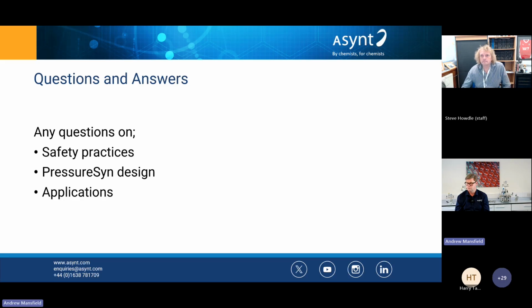Of sodium hydroxide or potassium hydroxide. I think when we're talking about chemical compatibility, this is where we start getting into the particulars about the ratings for different temperatures and pressures, because essentially that will take into consideration these calculations of the risks of different grades of materials. So obviously stainless steel and glass wouldn't be appropriate with high concentrations of hydroxides, but PTFE is perfectly compatible, and we can line the reactors with that.